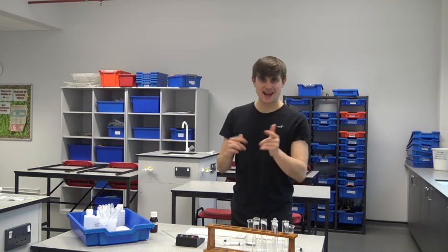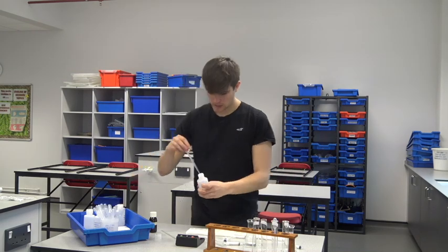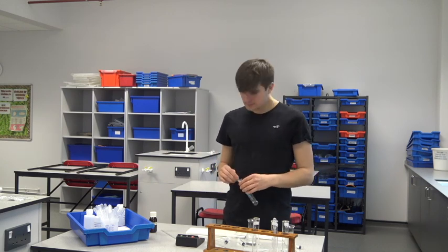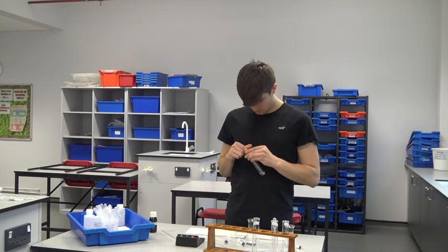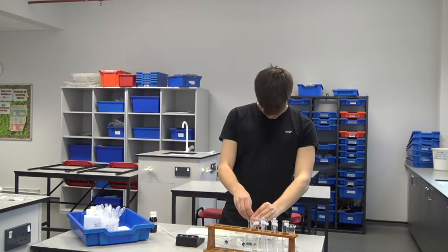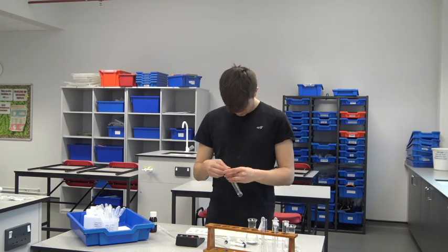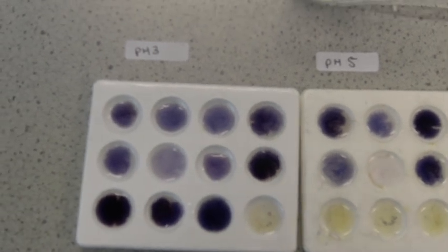Let's do pH 7 and pH 10 quickly. Now let's look at the results we collected during this experiment.